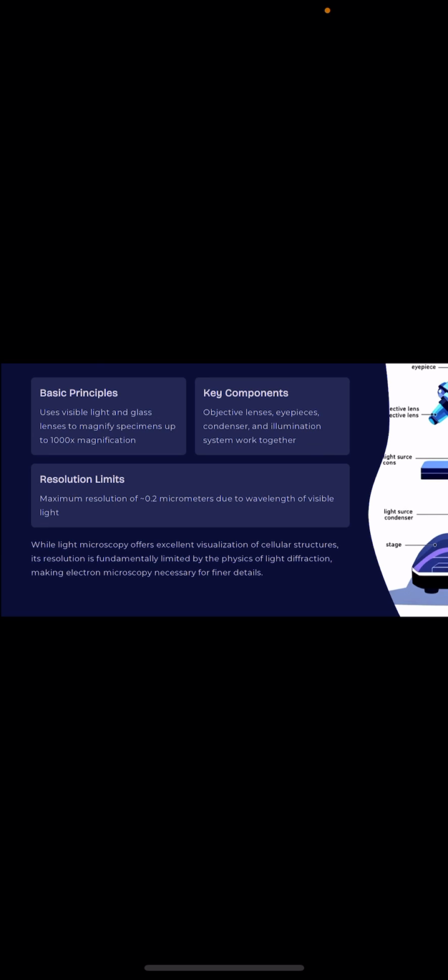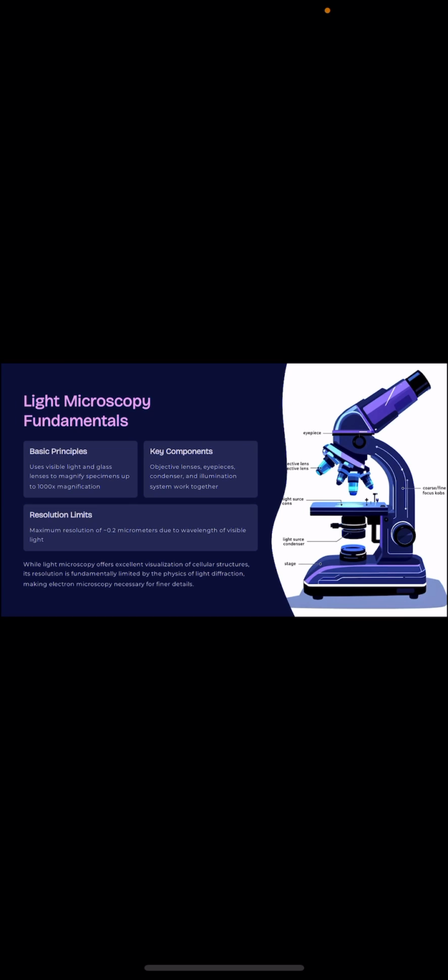So this is why many researchers and scientists prefer using an electron microscope instead of a light microscope. But also, in many common biology labs and life science departments, a light microscope is present to view cells and tissues. This is the picture of a light microscope, if you can see.